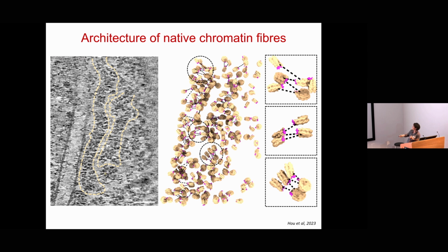And this is like a low range partial high order structure that has been captured in vitro, but they are very rare. Most of them are actually very flexible, no rigid 30 nanometer fiber, and they form a zigzag flexible chromatin fiber. But of course, this is one state, from T cells. We have yet to look at the other cells.